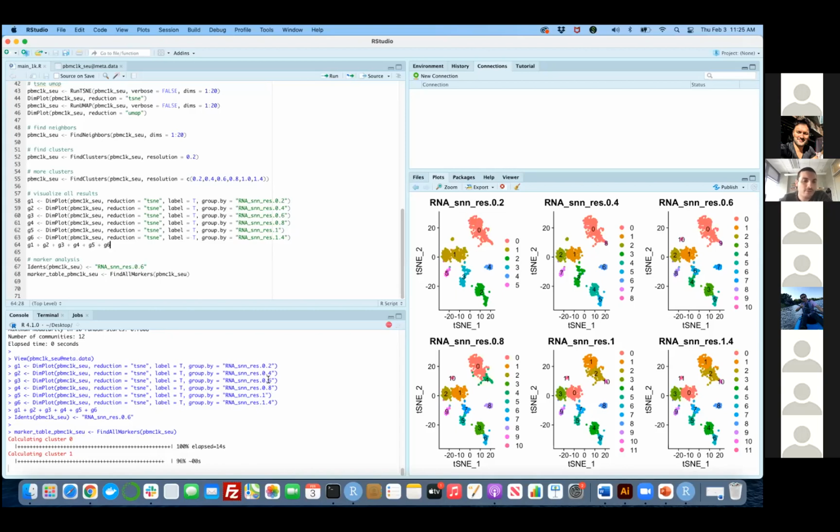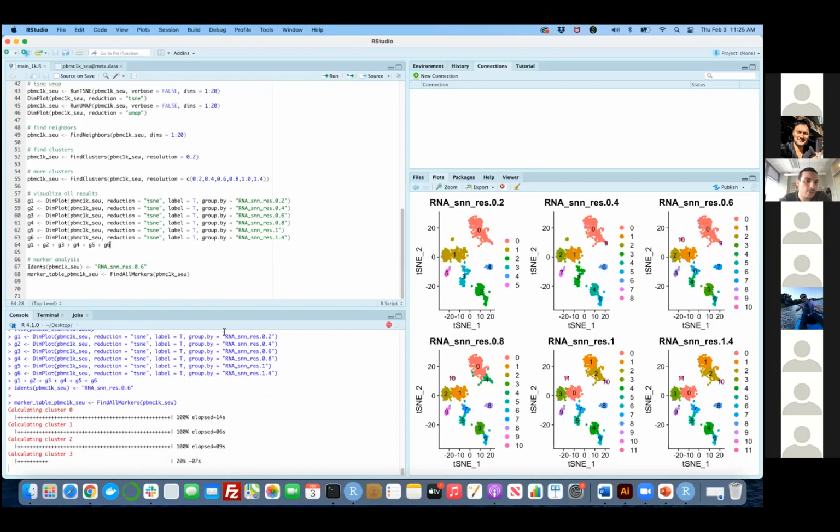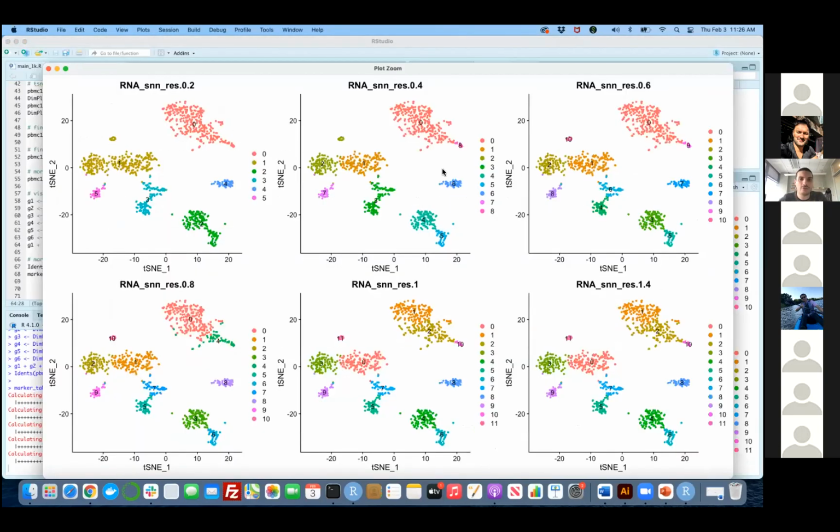At some point, we will see that some clusters will be harder to determine their annotation or their cell type identity. In this case, we are going to do a bit more focused analysis, where we compare cluster 0, not with all other clusters, maybe just cluster 1 against cluster 2, which will be the case over here.